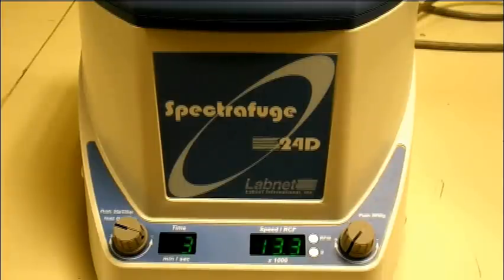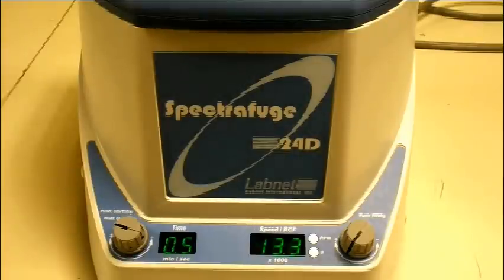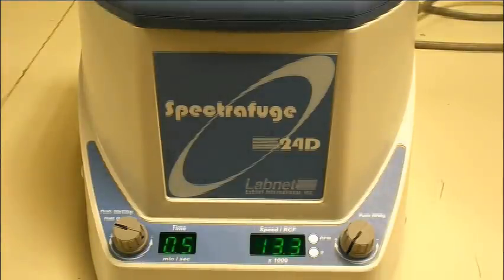And it should power down here in just a few seconds. And there you have it — in about 40 seconds, it went from 0 to its maximum speed and back to 0.